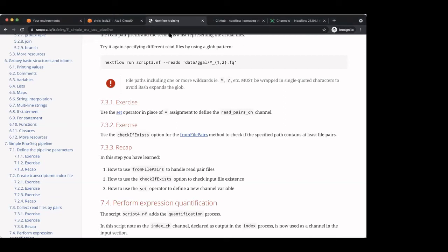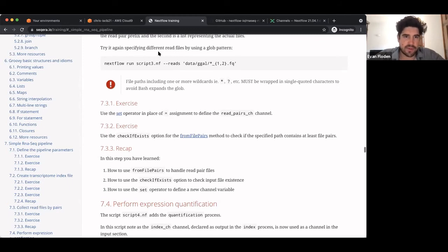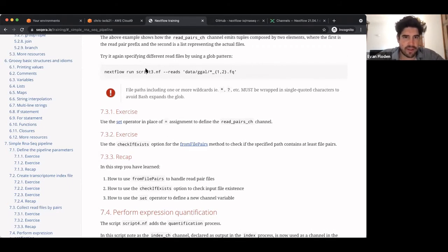Okay, cool. Perfect timing as well. The time has just gone up on that one. So let's go through and quickly do these. The first one here is actually written for you, the ability to run this. And as I said, you can define and change the parameters. We've seen this many times, but from the command line now. One thing to note is to make sure that these are inside these single quotes, because this is going to do some expansion, so it's really important to put that inside those quotes.